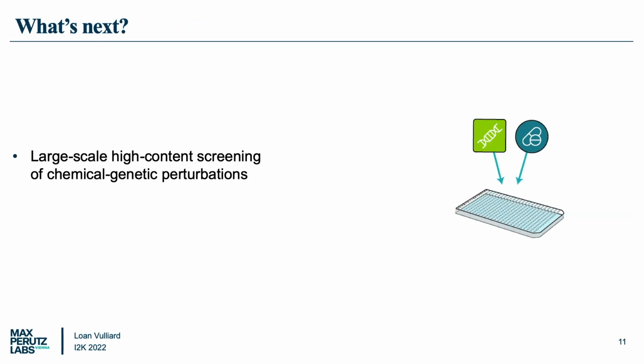And what's next for BioProfiling.jl? So we are not specifically a tool development lab, but we are also interested in applications. And we are right now using BioProfiling.jl to analyze some chemical genetic screens.